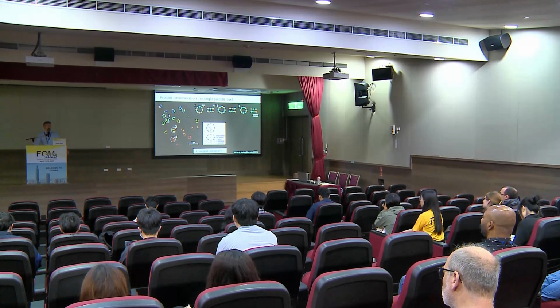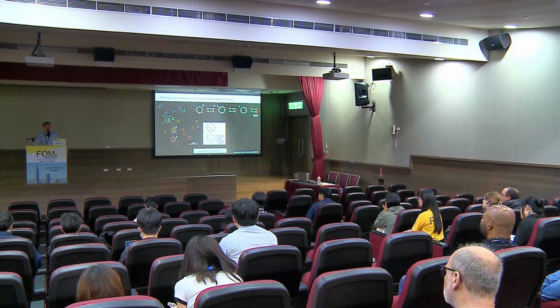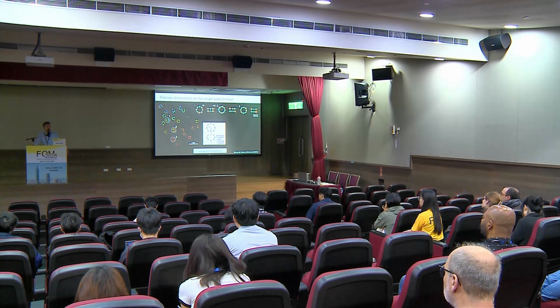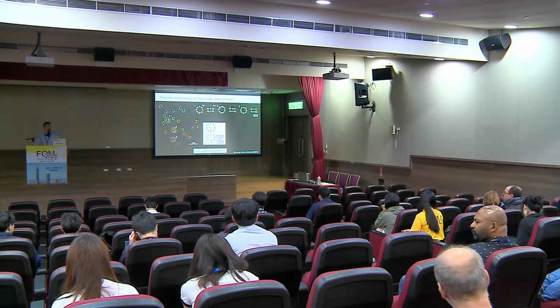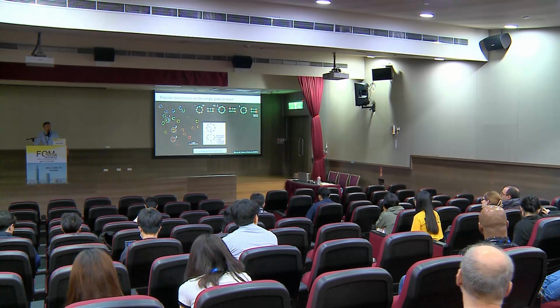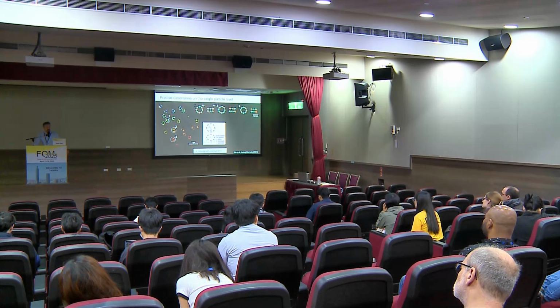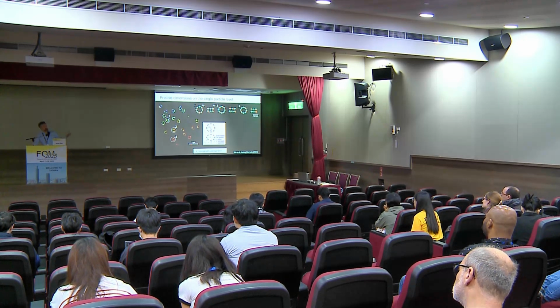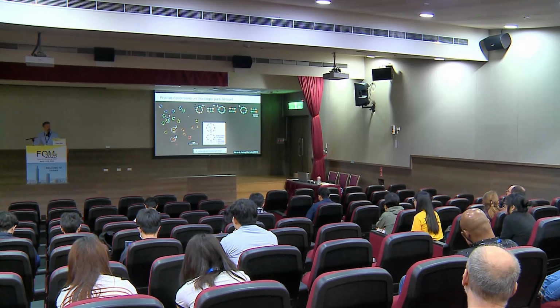And for the biologists who don't have MATLAB, who don't know how to run Jupyter notebooks, we also put it on Google Colab to directly run it from the internet. And I understood correctly that I can also use it for simulating MINFLUX tracking, not only imaging, right? Precisely, yes. You have to define the motion of the molecule and then it simulates it with this motion.